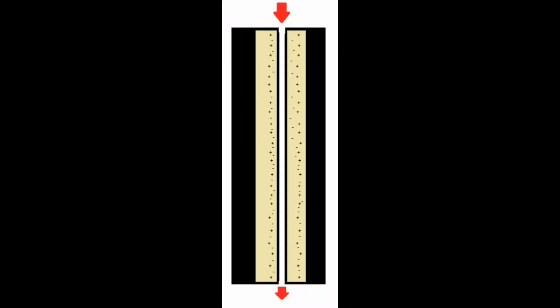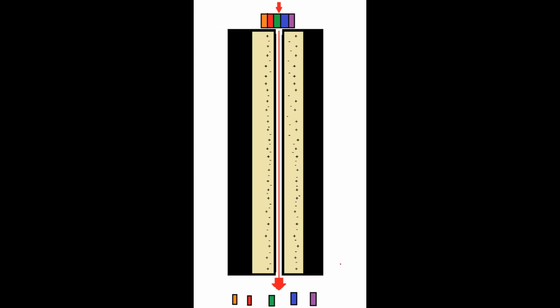The liquid moves through a cylinder of a generally known charge that the liquid interacts with. This either slows down the movement or speeds it up. It is very much like distillation, except it can increase or decrease the speed of movement. The product then gets to a point in the cylinder where the compounds are too slow in comparison to one another, and so separate into what is known as a fraction.